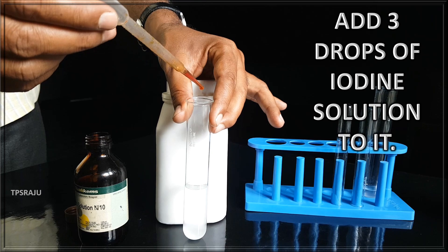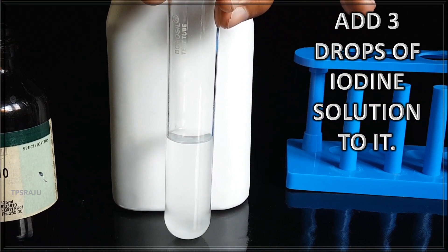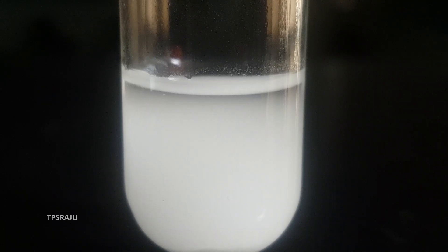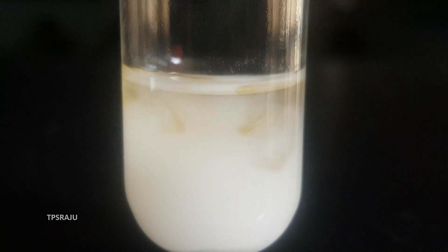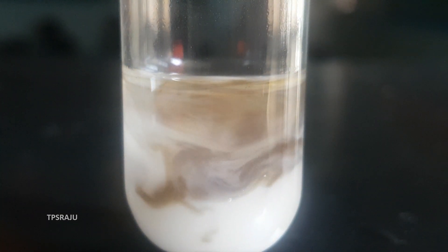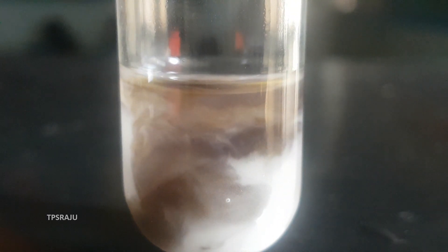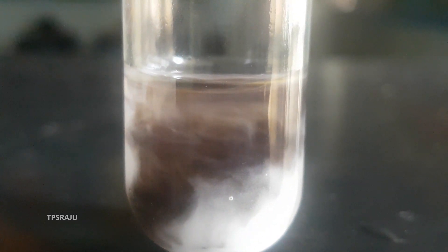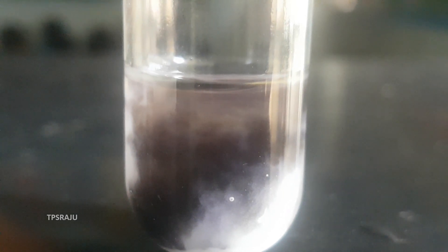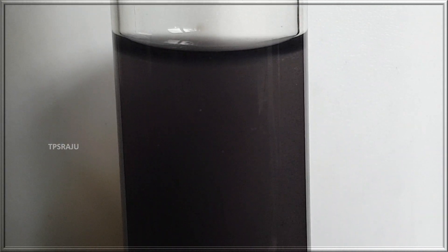Then add three drops of iodine solution to it and observe carefully. The starch solution turns into a blue-black color.